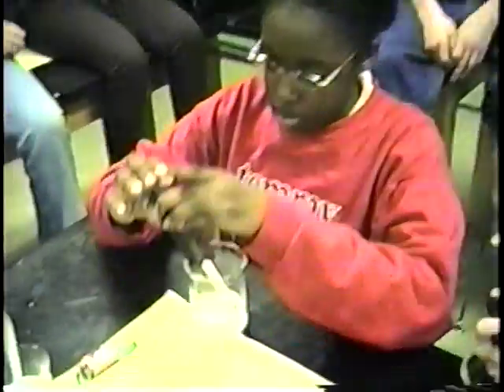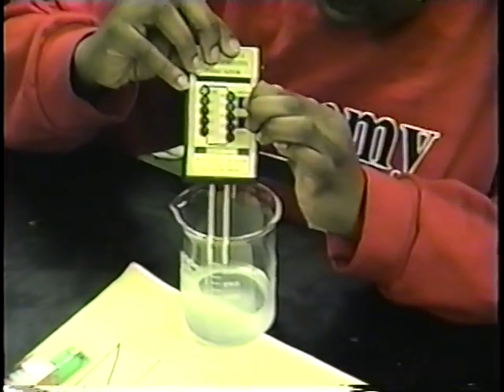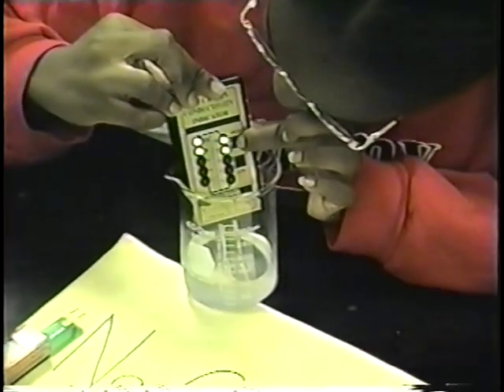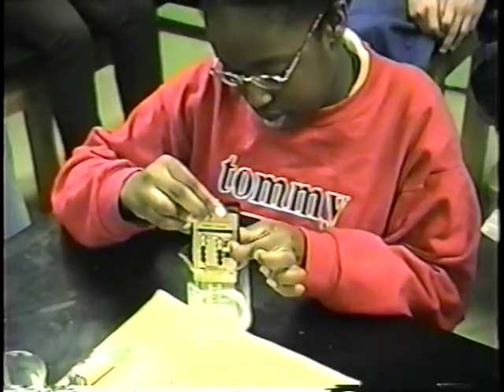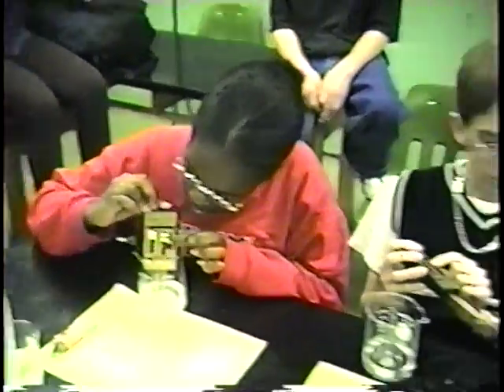So, Opal, you're working with salt water. Press the top button and put it into the thing, and tell us what's the highest light that you've got lit. What number? 9. No, wait, 10. 10. So that's a pretty strong electrolyte because it's producing a lot of ions so that the top number, which is 10, is lit up for you.